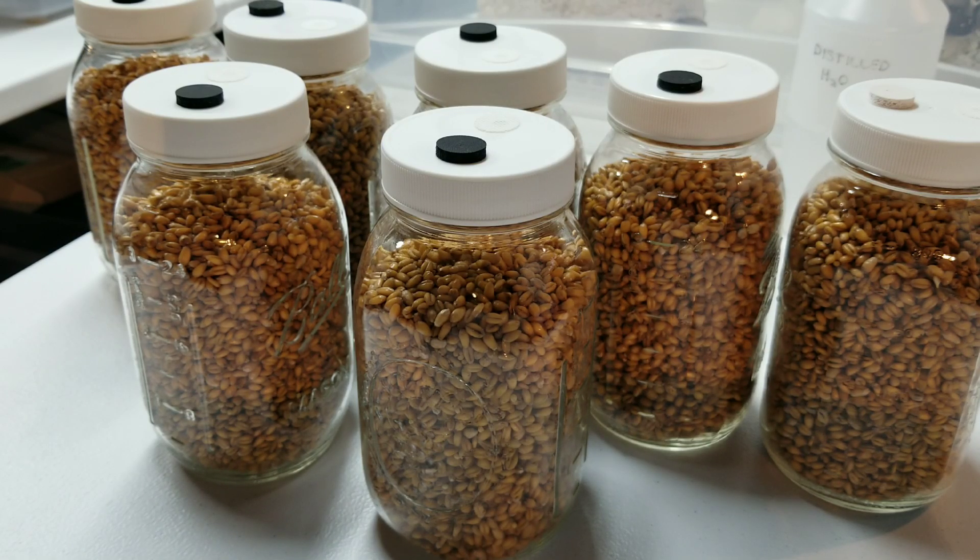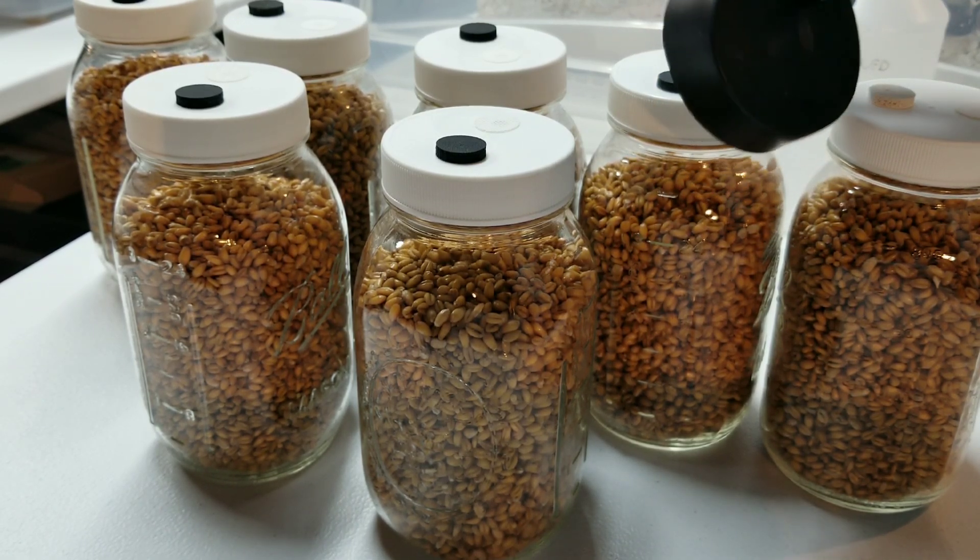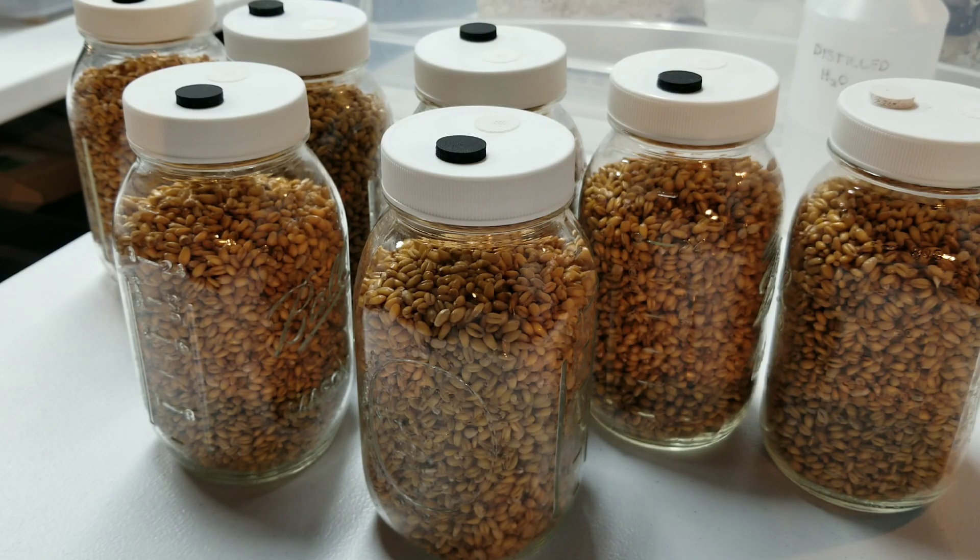This inside surface looks nice and dry - just nice plump grain kernels. Because we let them air dry, they're not bringing any excess moisture to the inside of the jar. If it looks like this, you nailed it. We have our seven quart jars perfectly filled, caps on nice and snug, ready to go into the pressure cooker. Seven quart jars fits perfectly in the bottom of a Presto 23 quart pressure cooker, which is what I'm using.